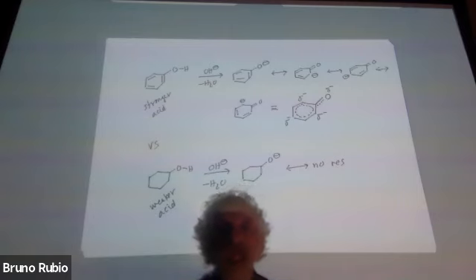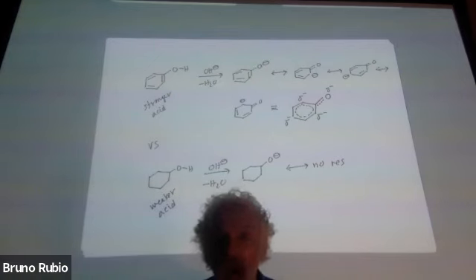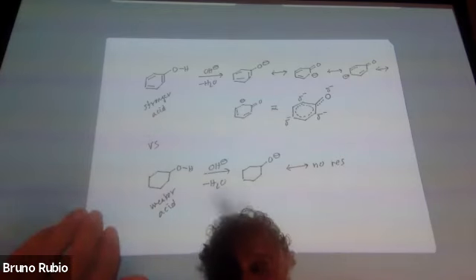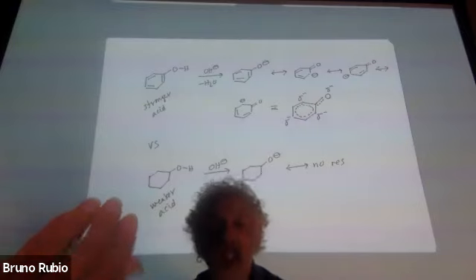Okay, so in the synthesis of nerolin, the first step is the formation of this anion with the O- on the negative charge. And so that can be accomplished easily by adding sodium hydroxide. If we added sodium hydroxide to this, we wouldn't get much of a reaction because this proton in cyclohexanol doesn't want to go away. Because when it does, you get something that isn't stabilized versus the situation up there with the naphthol or with the phenol. Okay, so that's the first step, which is the formation of this O-.